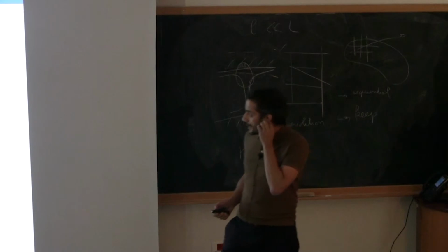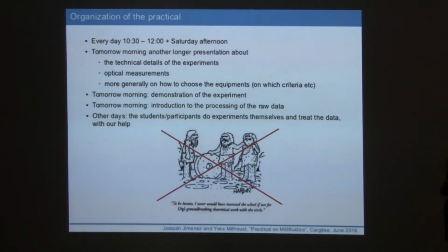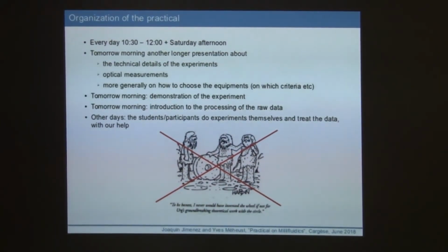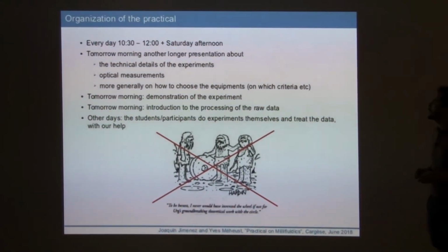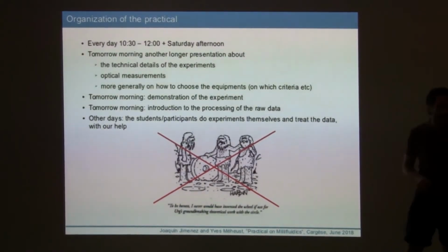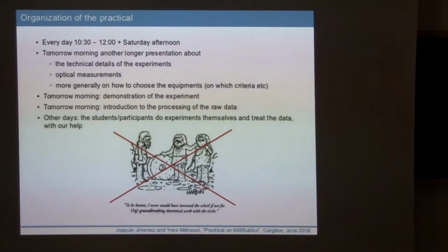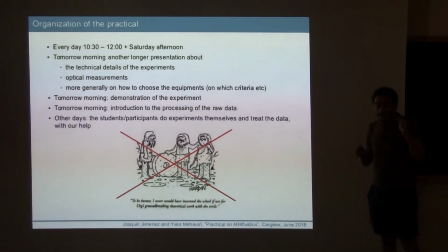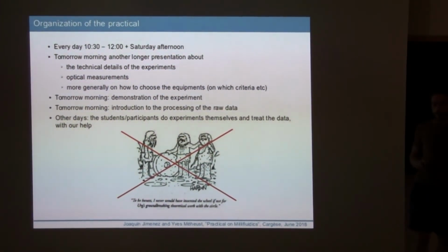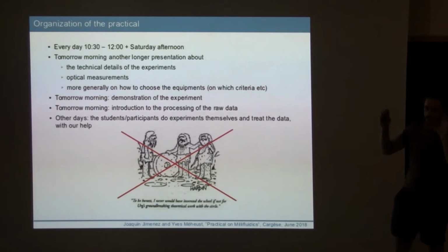So how will it be organized in the course? It will be every day, as you know, from 10:30 to 12. This is for every practical course, and also on Saturday afternoon. Tomorrow, Yves and I, probably with the help of one student, Mayumi Amada from Lausanne, a student of Pietro, will give you an introduction to the experimental setup, every component of it. We're going to run an experiment for you, and give you a very simple script in MATLAB. You can write in Python or whatever you want to analyze or post-process the images.